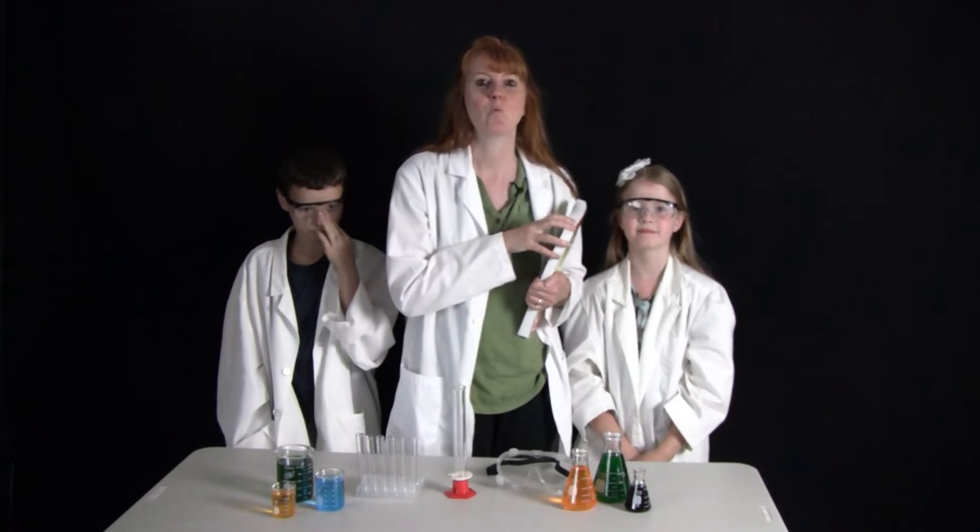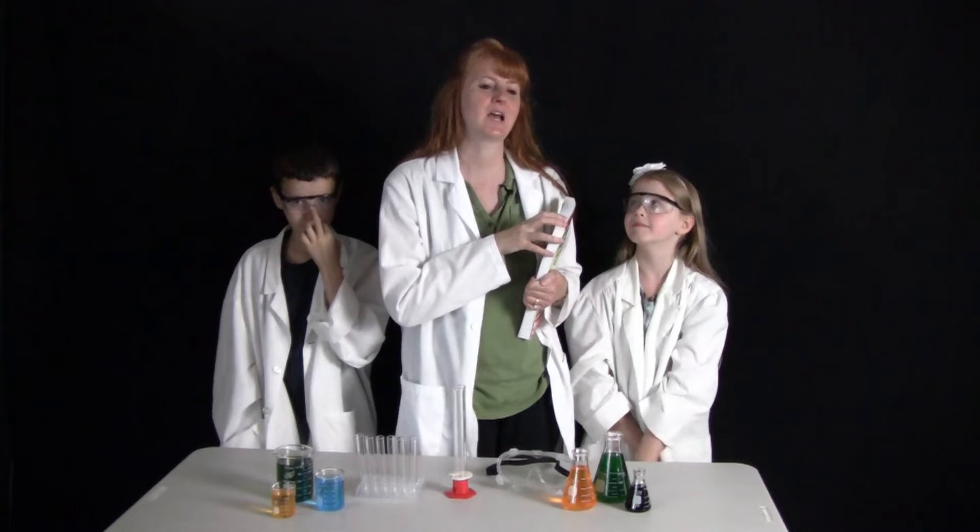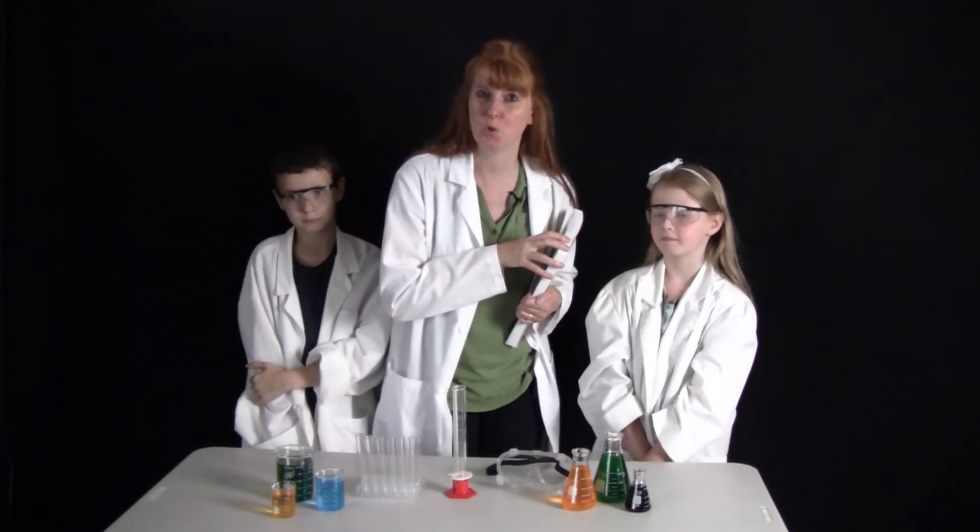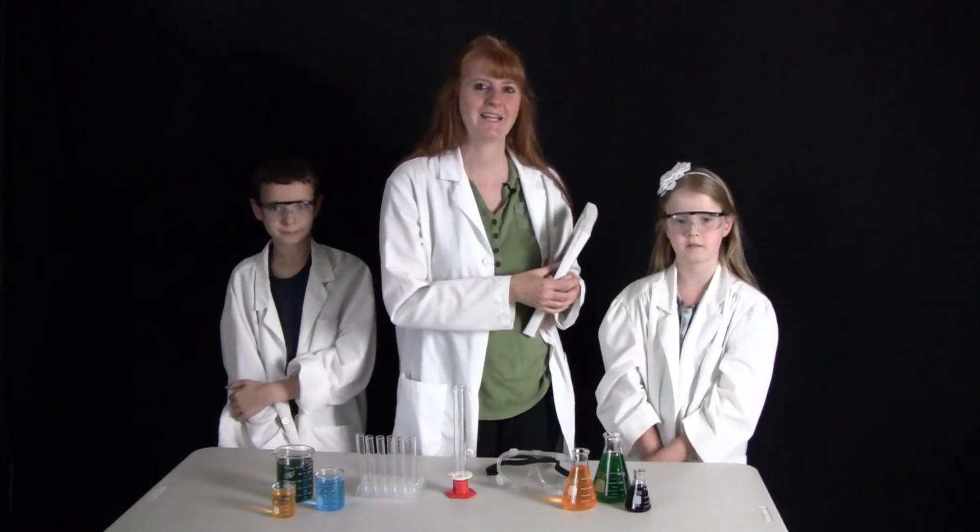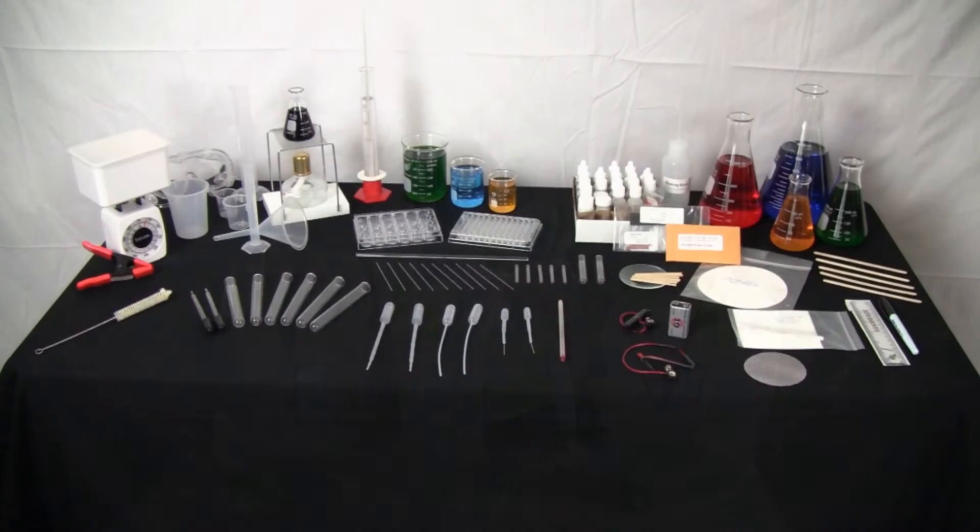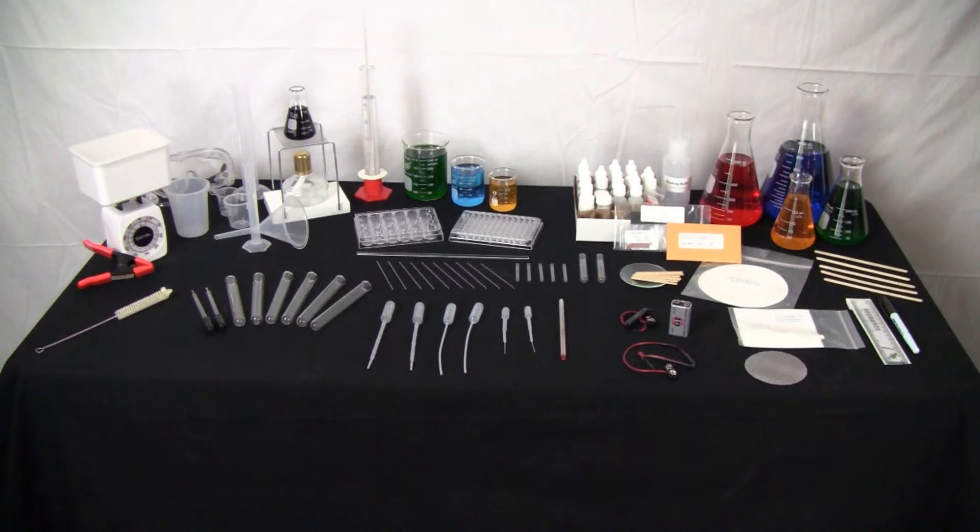So this first one is an introduction to a chemistry tool. So take a look at some of the tools that we use to study chemistry. Here are some of the chemistry tools you might encounter when you are studying chemistry.